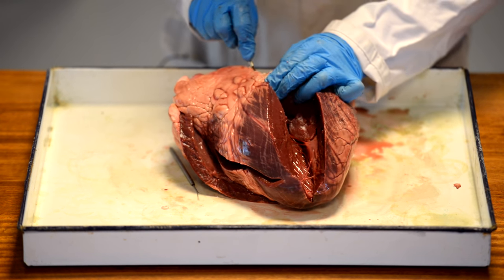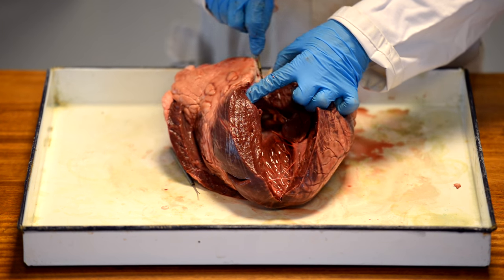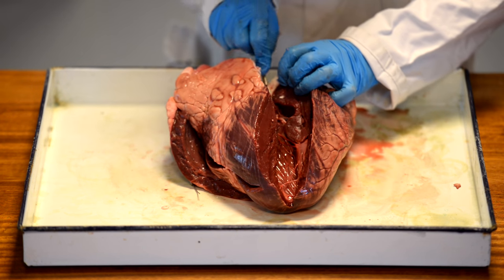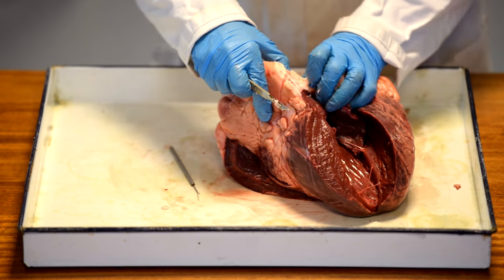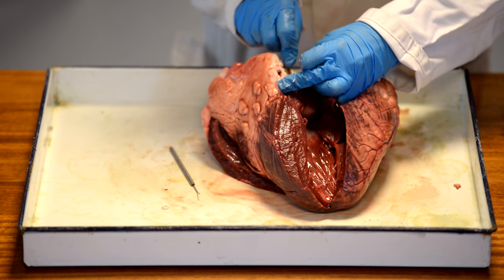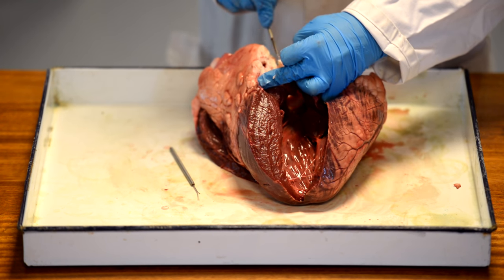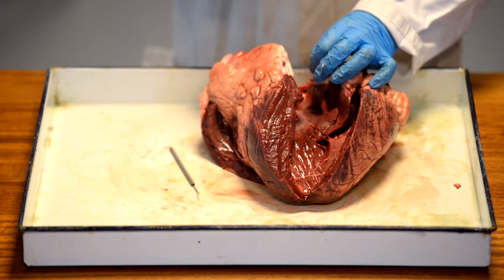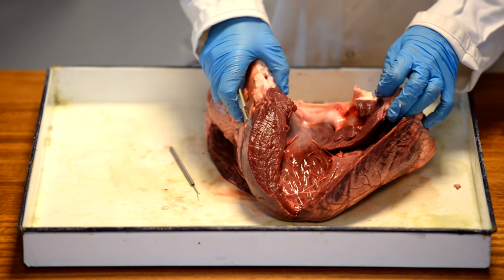I don't think the fat in a living animal is quite as hard to cut through as the fat in a dead one. Here we go. Not so easy to get through. Let's try just a little bit offline. There we are. You can suddenly feel the tension going when you're in the right place. So here we are, just cut through the valve tissue.